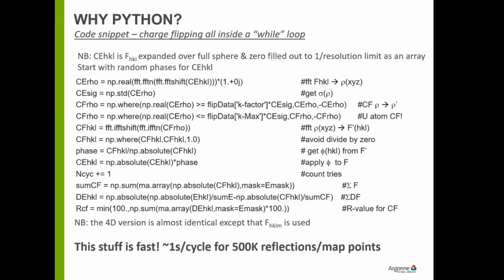You just keep doing that over and over and over again. What happens is that the sort of messy stuff winds up resolving itself into peaks with a relatively flat background, and you have a crystal structure. Seems like magic, but I'll actually talk a little bit about it on Thursday.